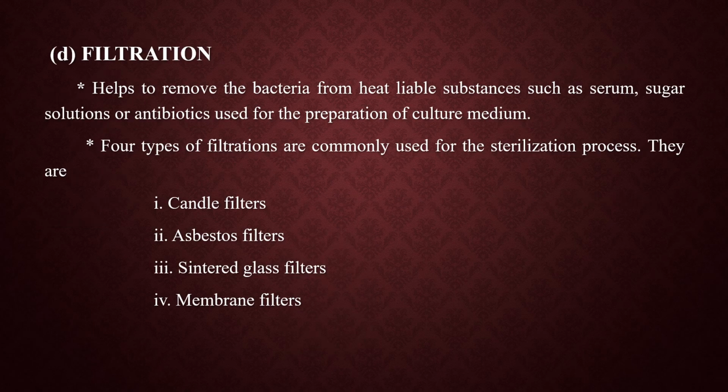And the fourth one is filtration. Filtration helps to remove bacteria from heat-labile substances such as serum, sugar solutions, or antibiotics used for the preparation of culture medium.